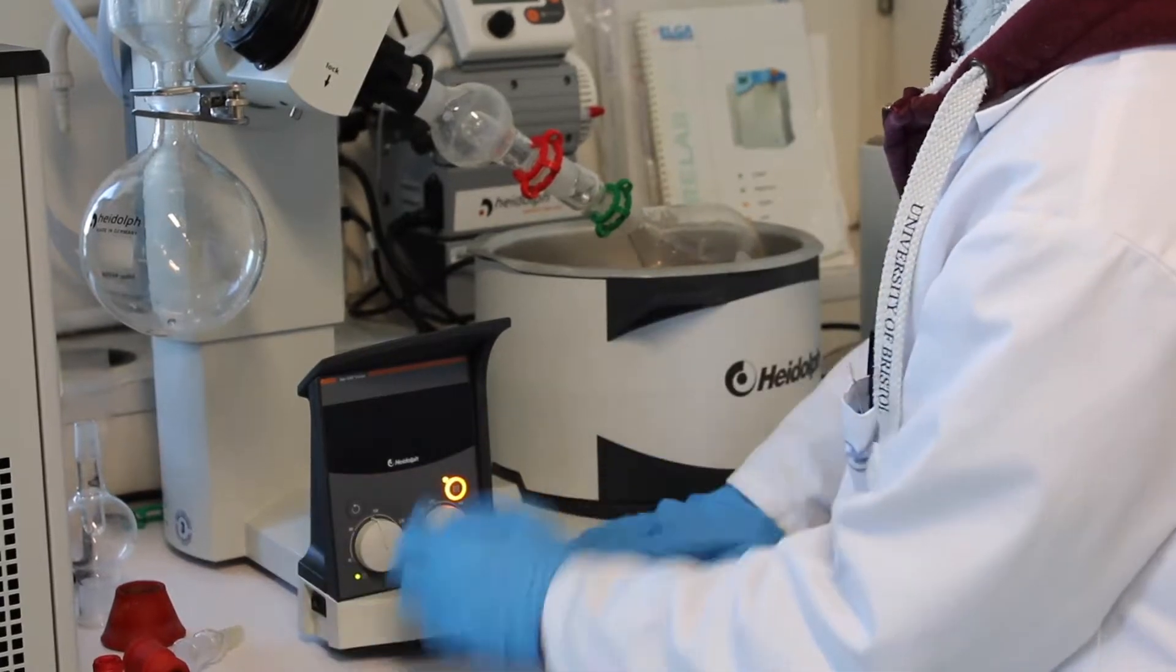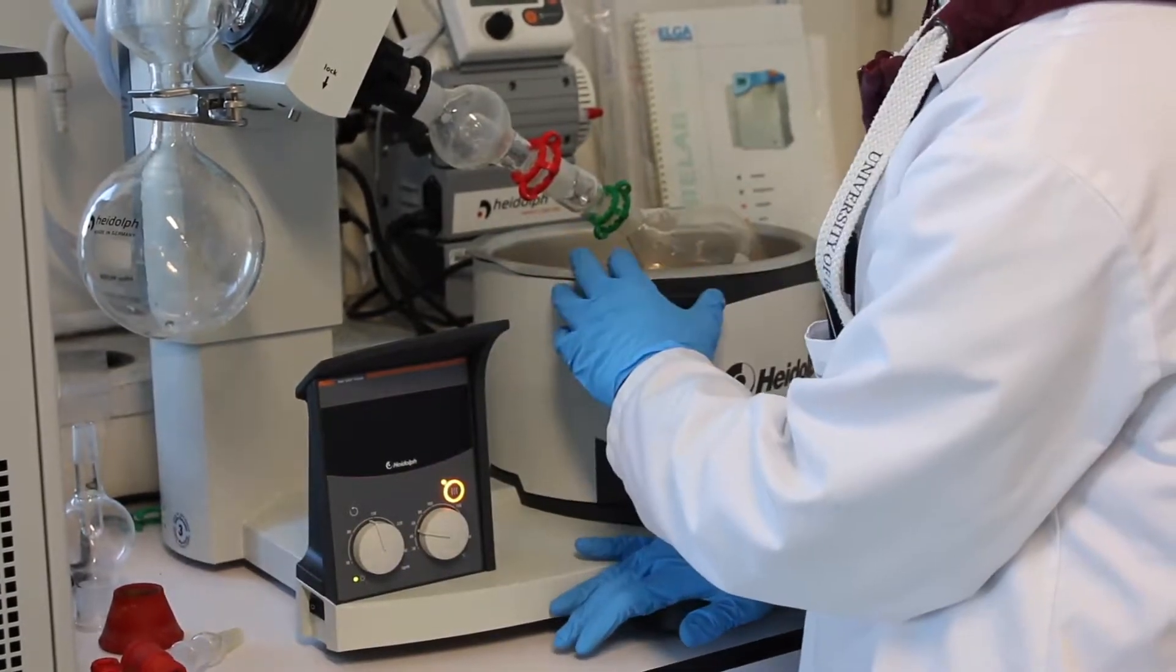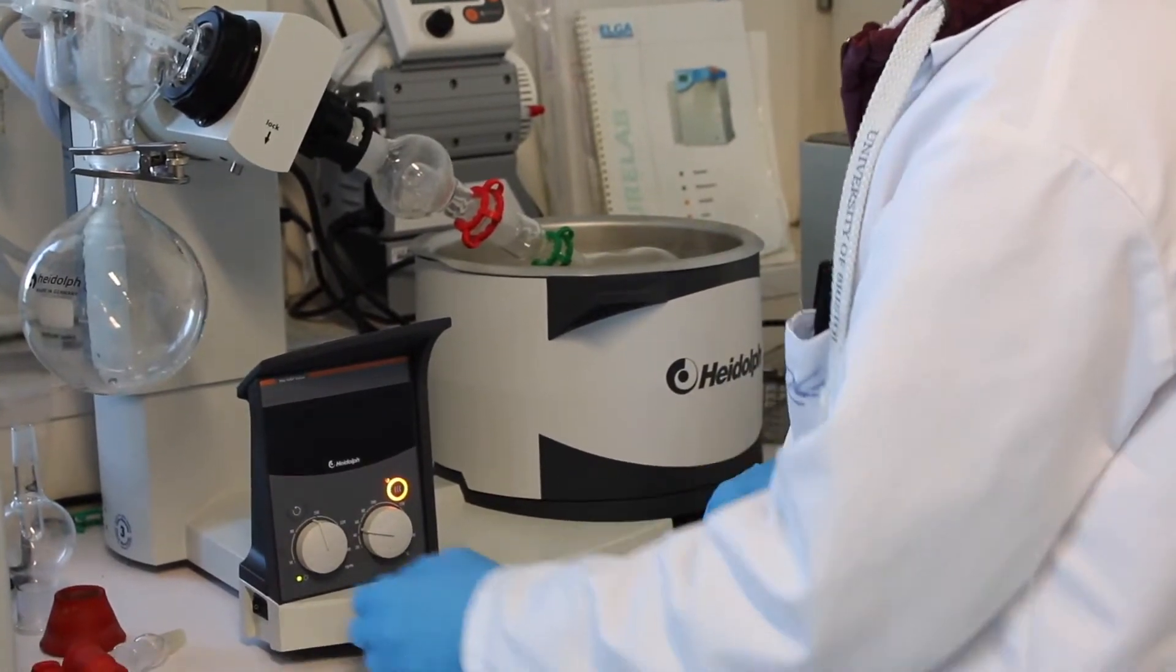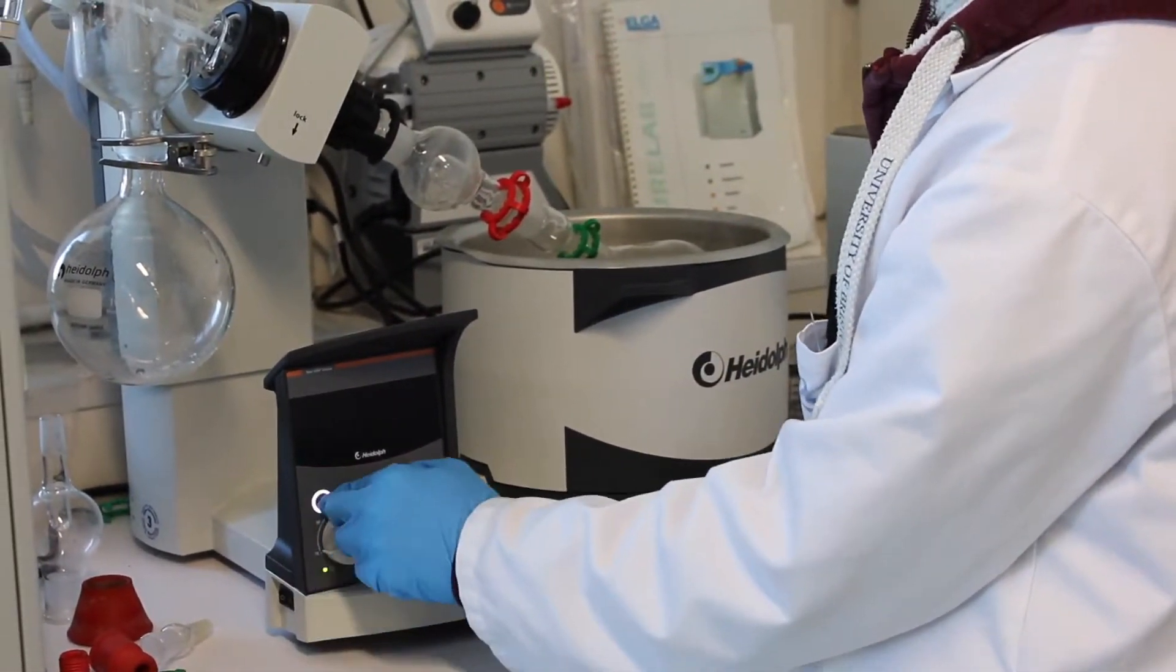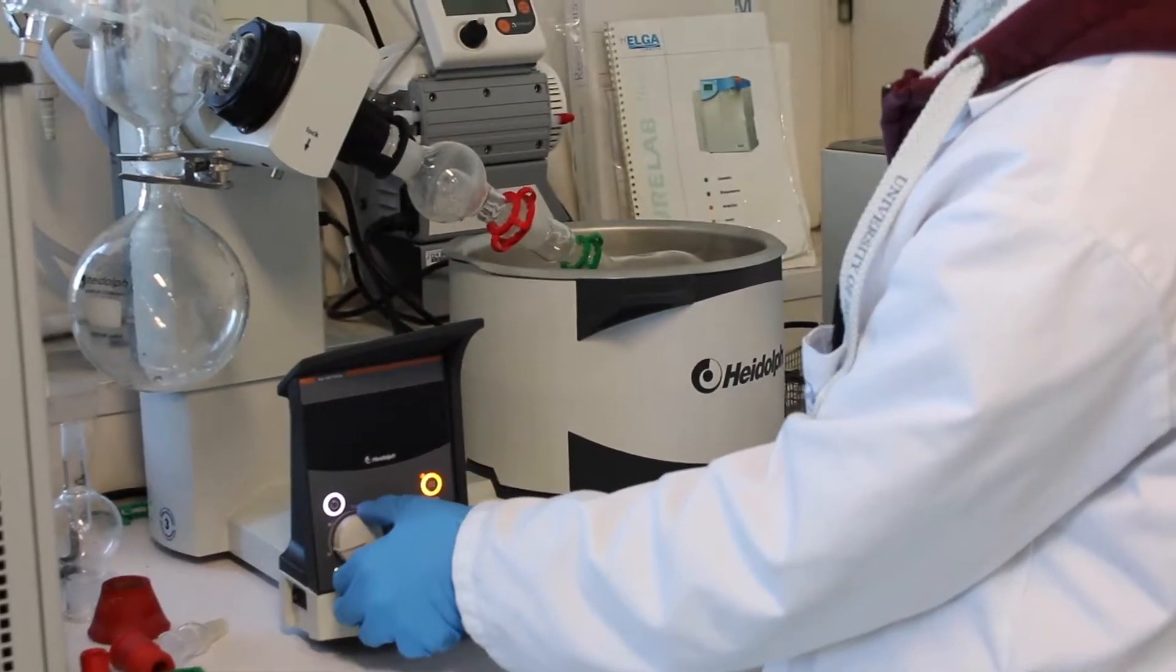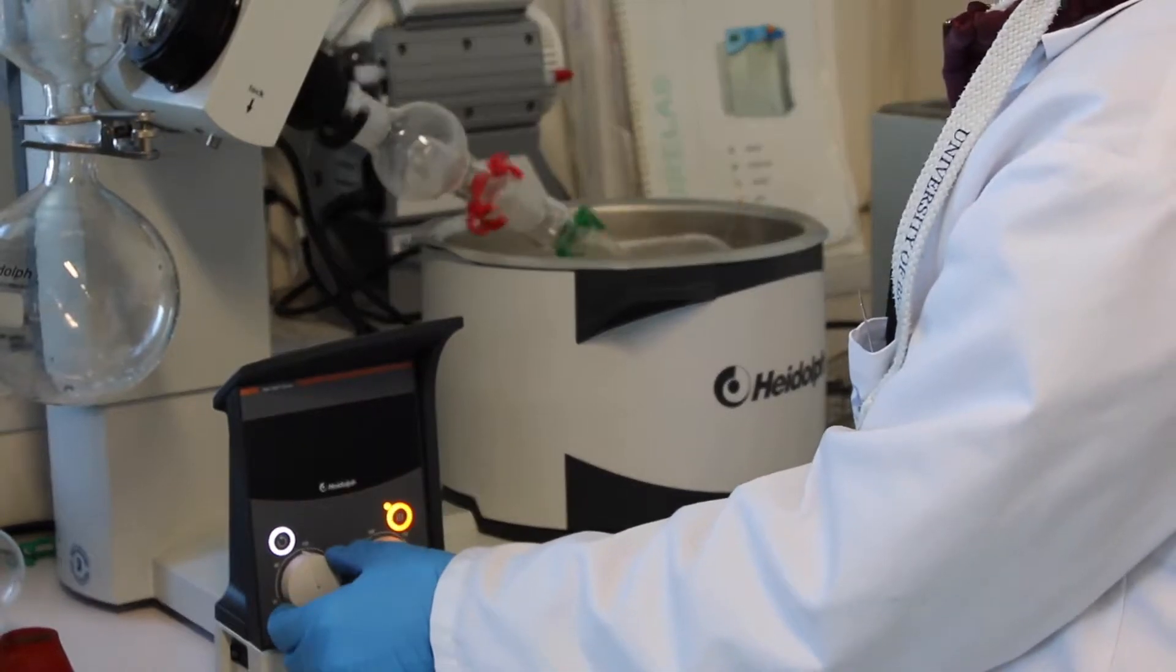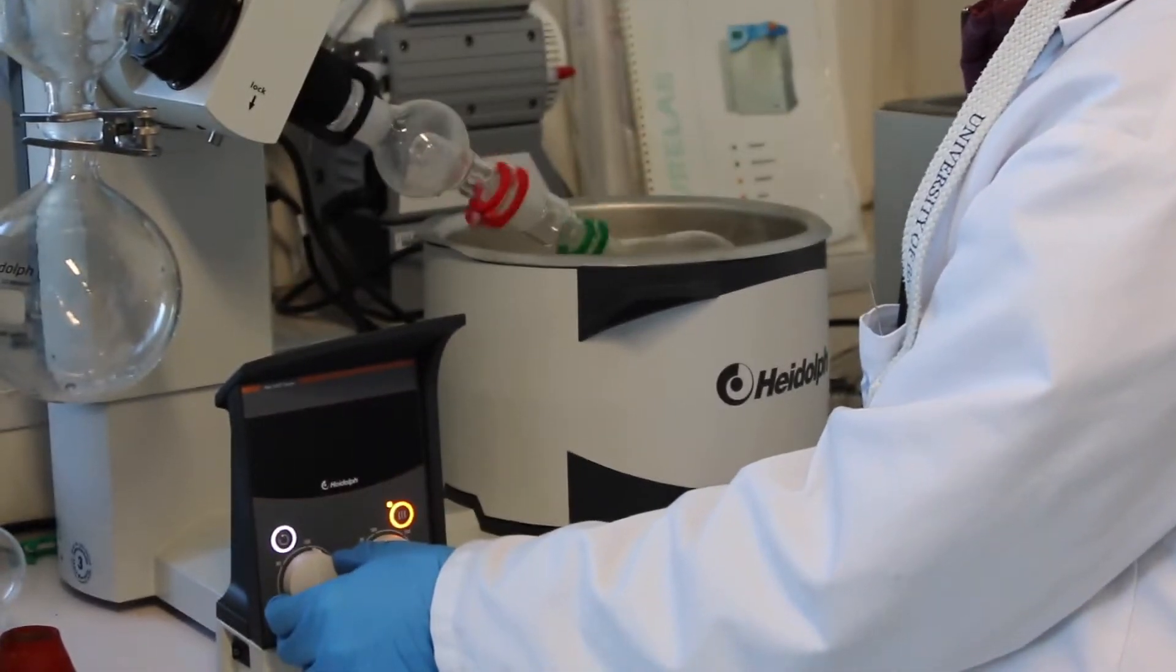You want to lower the flask into the water bath. In order to do that, you use this handle here. And you turn on the spinning motion. You want a nice and fast spinning such as this one.